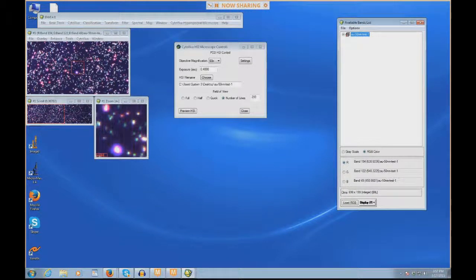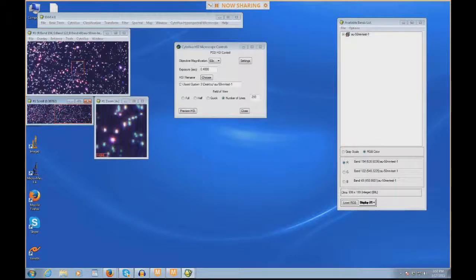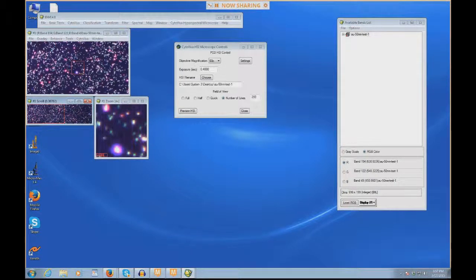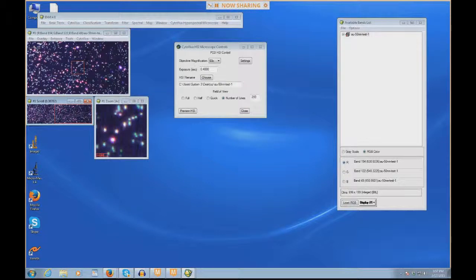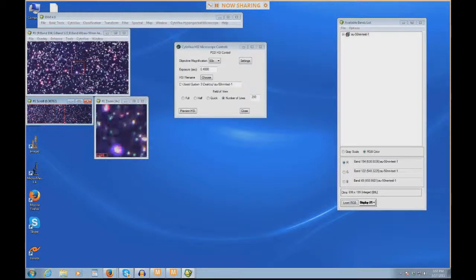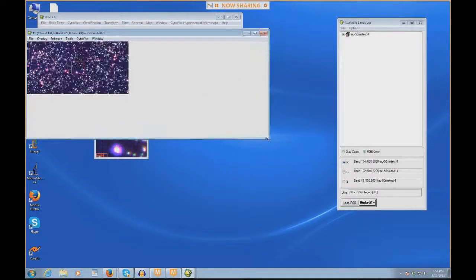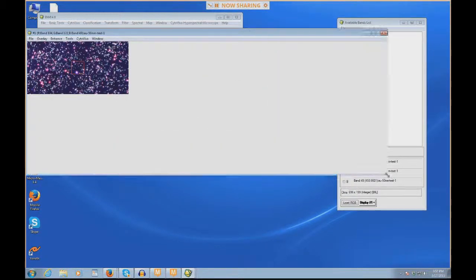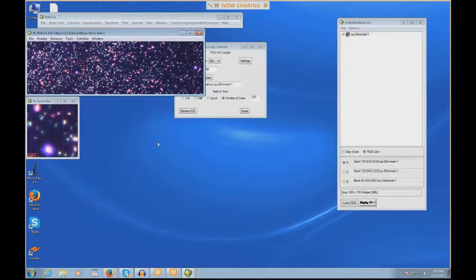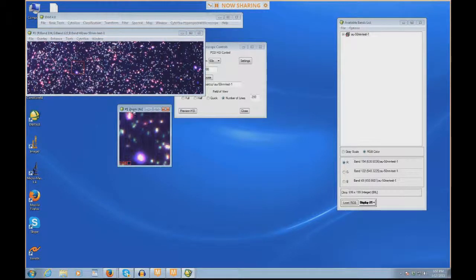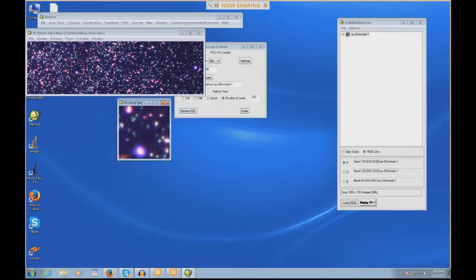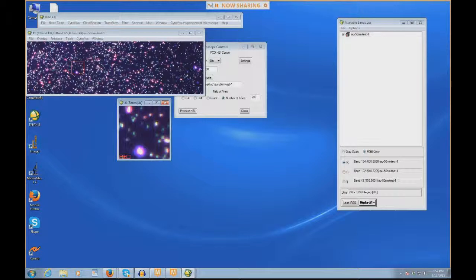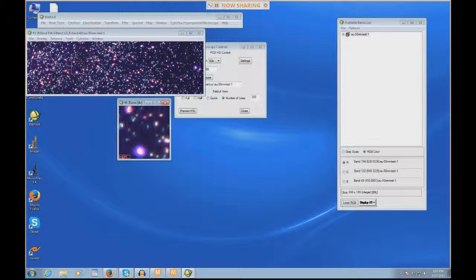Here is the image window. The scroll window actually represents the entire image. If I move this red box over to the right, we see it update here in the image window. I can get rid of this just simply by expanding the image window all the way out. Now there is no scroll window because we're seeing the entire image. This is what the particles look like. This is exactly how they look like in the microscope too. We had some particles that were very small in green, and then we had some larger particles here that looked almost red or orange. This is probably due to aggregation.